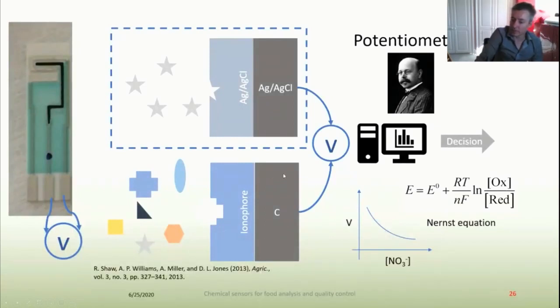I said if you pulled a pH sensor apart, you'd find that it had a reference electrode in it, and the meter is measuring the ion selective electrode versus that reference electrode. So we're measuring the voltage of a reference, and we're measuring the ion selective electrode versus that reference. So we're basically measuring a voltage difference between two electrodes.